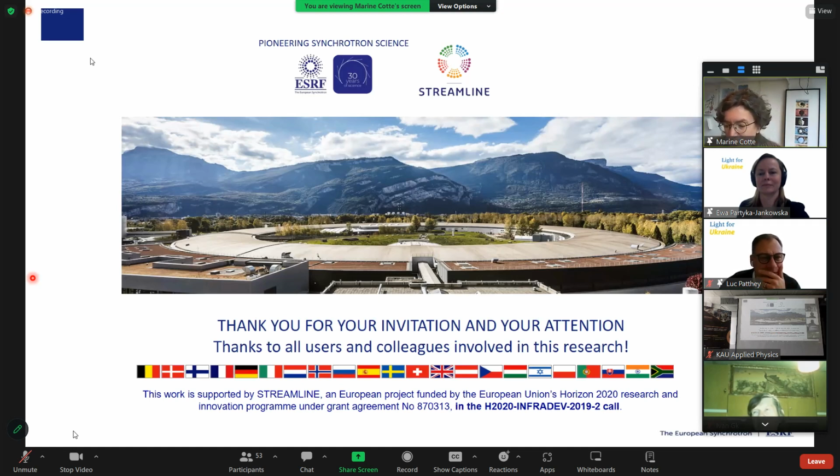After the EBS, many beamlines kept their previous undulators. In some cases, I think the straight section was too short, so some users had by default to change their undulators or insertion device because it was no longer fitting into the geometry of the source. At ID21, we did not make any change. But I know that there are many beamlines, for example, which are going towards in-vacuum undulators or cryo undulators. There is no single answer to your question, but for what we are concerned, we kept our undulators, which are pretty good. Okay, good. This is what I wanted to know.